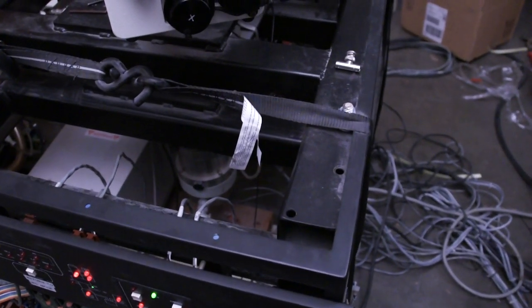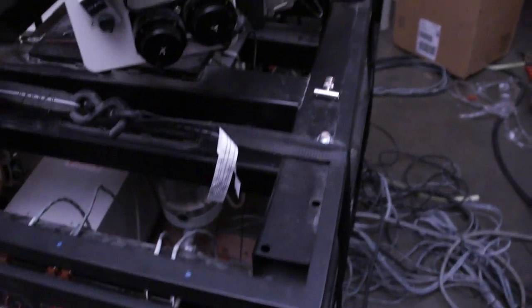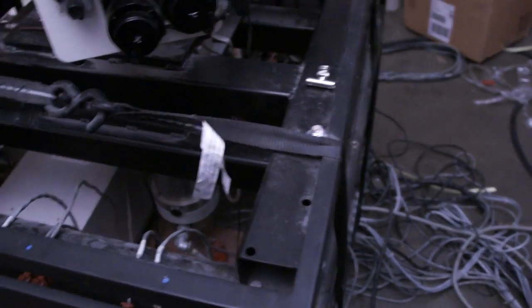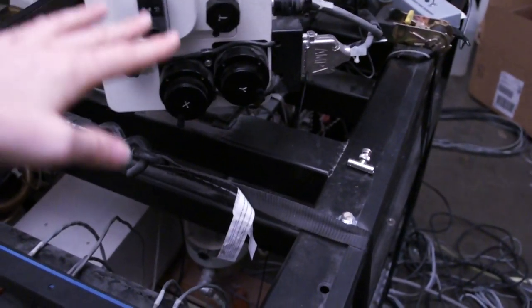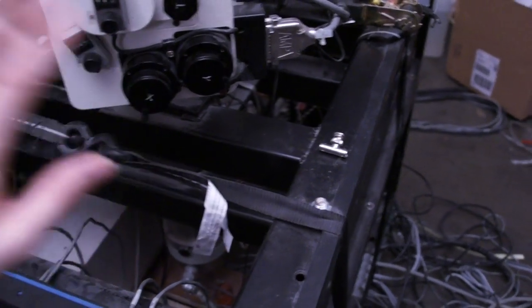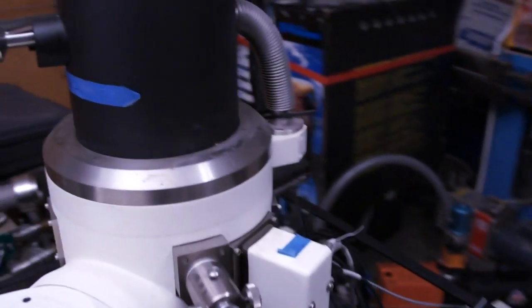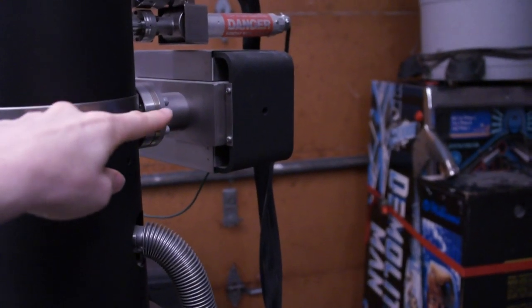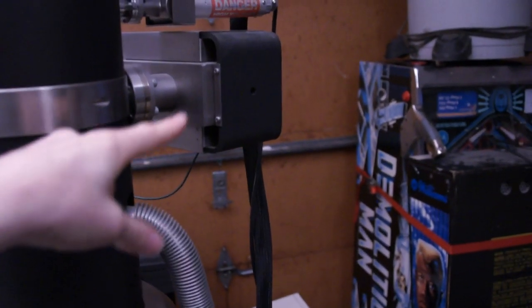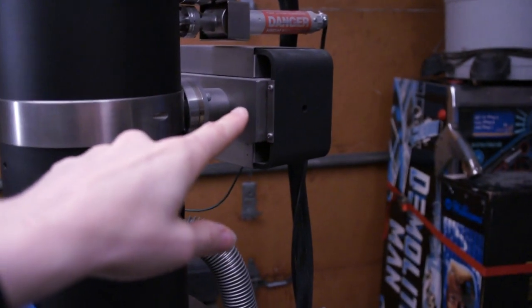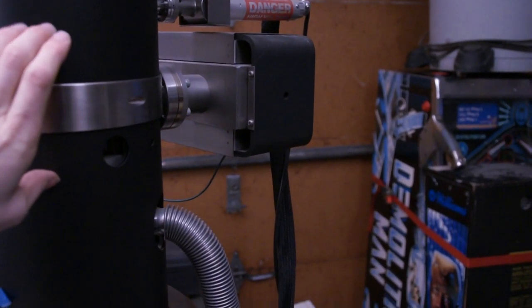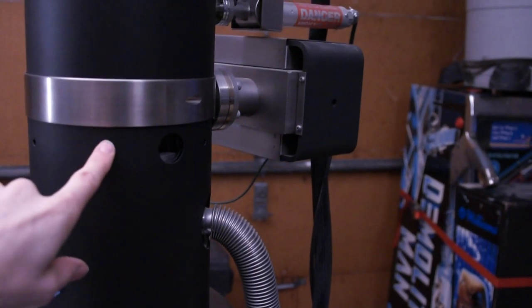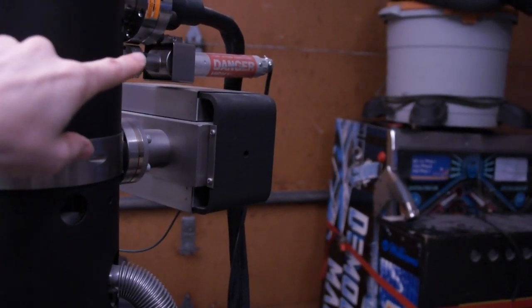Down under the sample chamber is a turbo pump. If you were to take that off and look down the barrel of it, it looks very much like a jet engine. It'll have stators and rotors, and molecules that find their way into the mouth of that thing will get sucked out and then pushed out to the roughing pump. Some of the other pumping schemes on here, there's two ion pumps. Molecules that find themselves in here get sucked into a magnetic field, twirled around, and crashed into the sides of the ion pumps. This is for the intermediate column, keeping the molecules from the specimen chamber from making it all the way to the gun. And then there's a dedicated gun ion pump there.